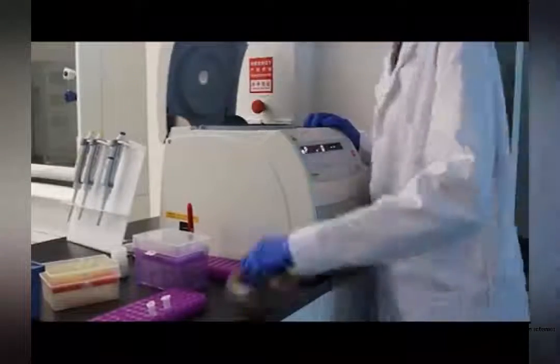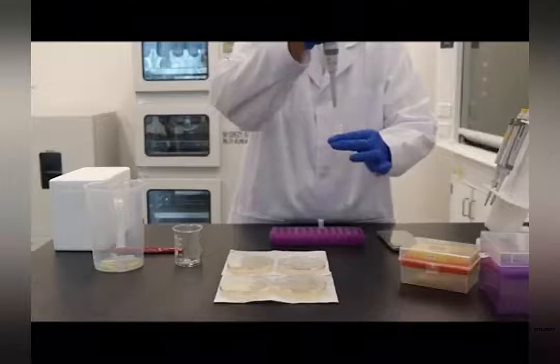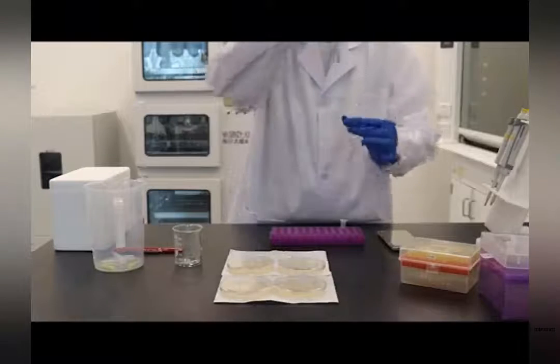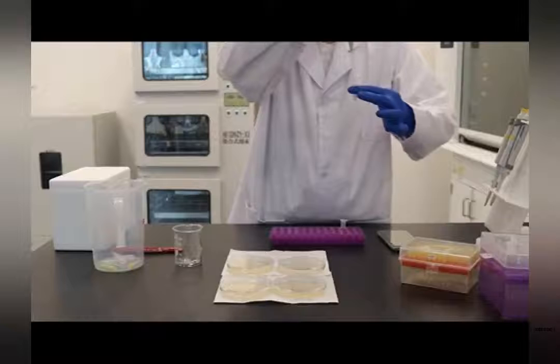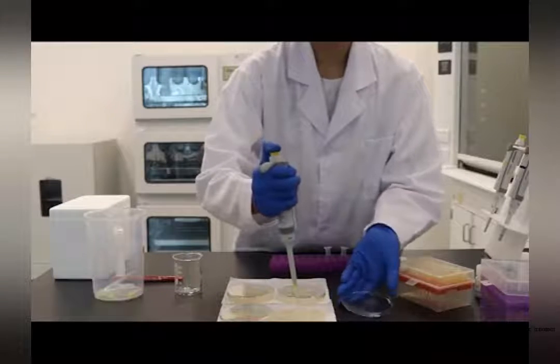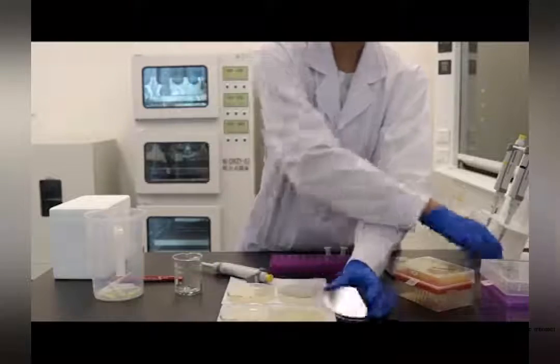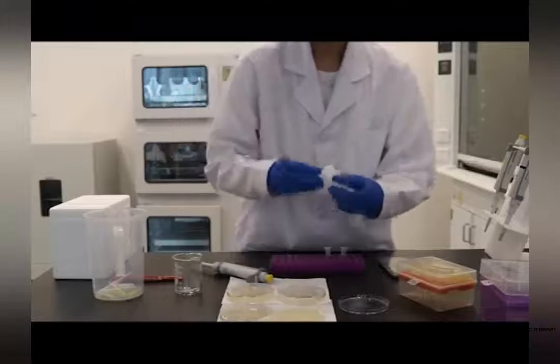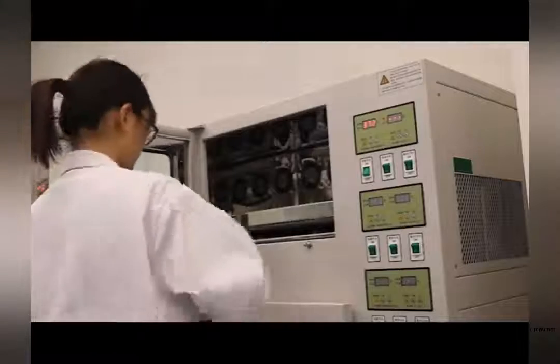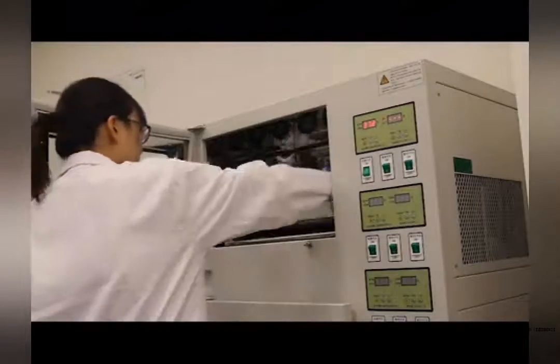After 20 minutes of incubation, spin the tubes down for 60 seconds in a microcentrifuge. Remove 300 microliters of the supernatant. Resuspend the cell pellets in the remaining 250 microliters of liquid by pipetting gently up and down. Transfer 100 microliters of the plus plasmid and the minus plasmid solution onto each of the plates correspondingly. Use 6 to 10 clean sterile glass beads for each plate to spread the cell solution by swirling the plate around. Stack the plates and tap them together. Place the stack of plates upside down in a 37-degree incubator until the next day.